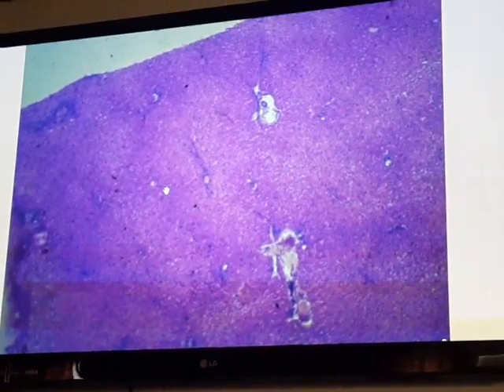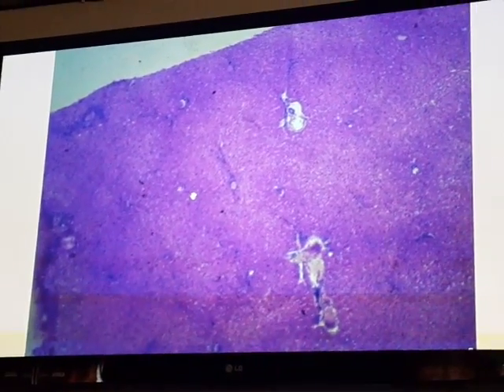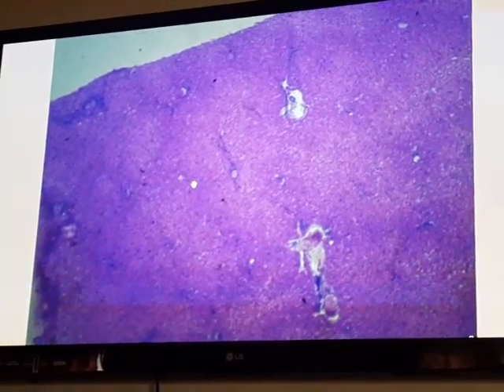In this lab we will examine the organ associated with the digestive system.